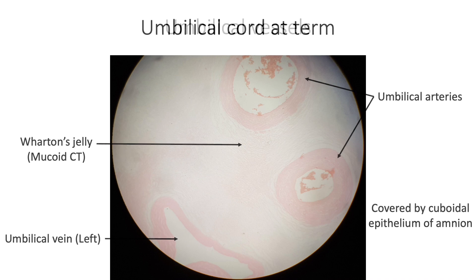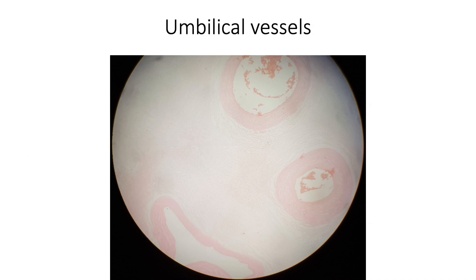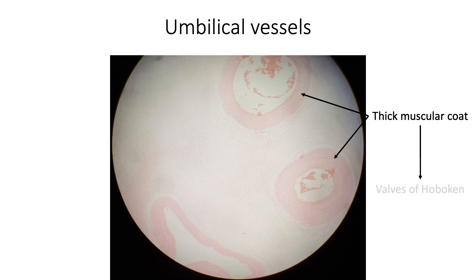The umbilical vessels show a thick muscular coat, and the smooth muscle fibers are spiralized and project into the lumen, forming the valves of Hoboken.